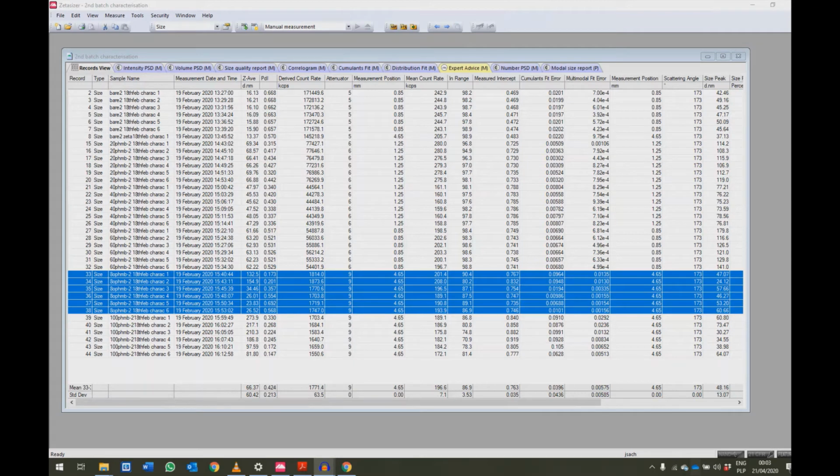You can look again at the same sample a week or 3 weeks later, depending on the data you have, and understand whether this change occurred in the quality of the data. So whether the sample is again sedimenting, aggregating, breaking apart, whether this quality of data can now be relied on, or is still below the quality that you would want it to be.